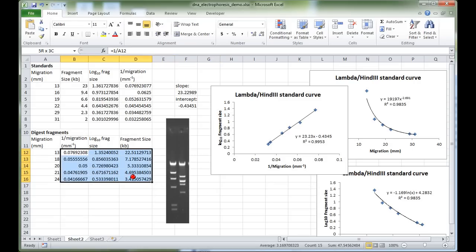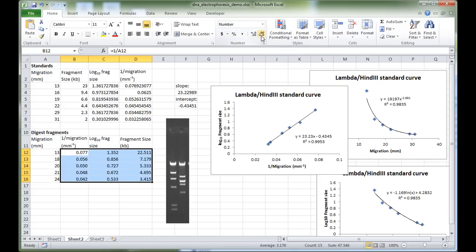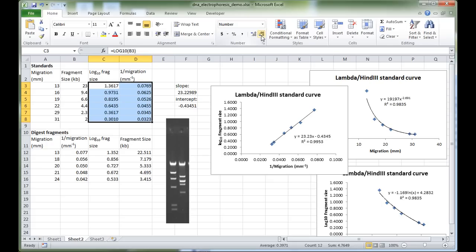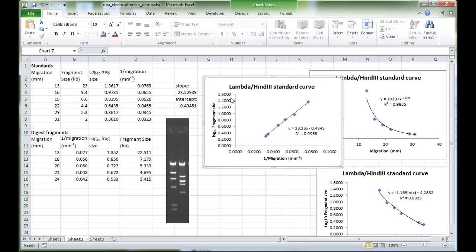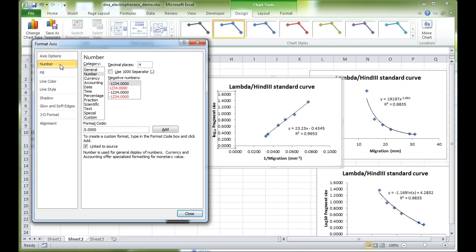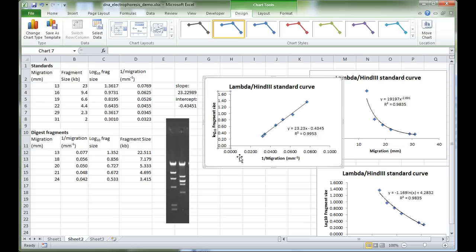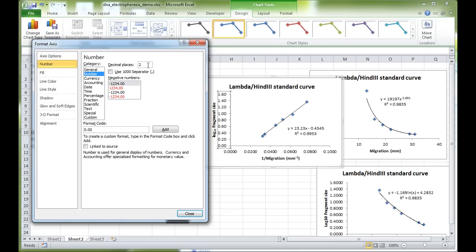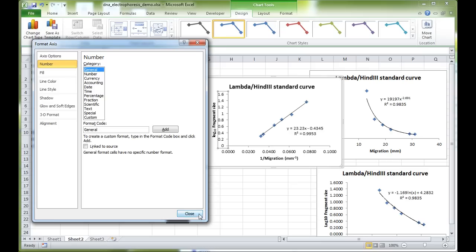To make the numbers neater, reduce decimal places by clicking the 'Decrease Decimal' button up in the toolbar. For the graph axes, if Excel automatically changes the axis decimal places, double-click on the axis numbers, go to the Number option, and change decimal places to 2 and click Close. Alternatively, switch to 'General' format, which will make the axis labels neat automatically.